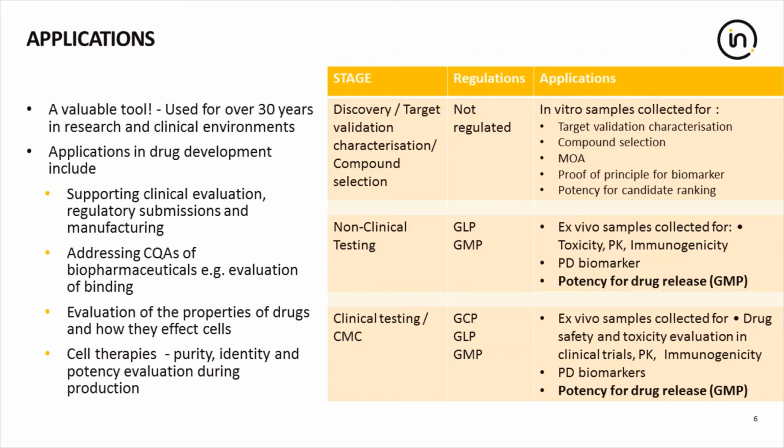These are critical components of biological license applications submitted to the regulatory authorities. Assays to evaluate functionality of biopharmaceuticals provide confirmatory evidence that they have the appropriate physicochemical properties and give structural confirmation. Validation of these methods to assess critical quality attributes of biopharmaceuticals is a key requirement for manufacturing under GMP environments.